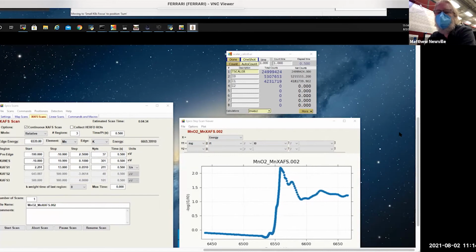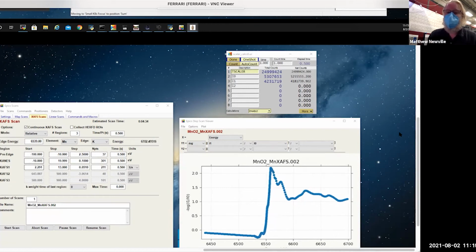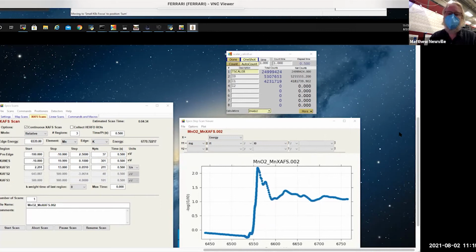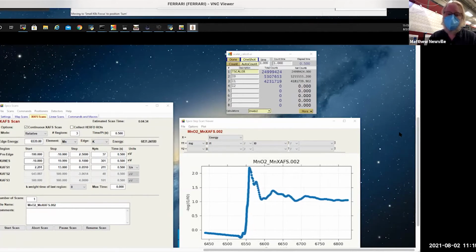Jay asked, can you give us a tip to make a good sample? Right, so for XAFS measurements, in general, you measure the sample you have. It depends on the systems you're looking at. For transmission XAFS of concentrated samples, like these simple oxide powders, these are the hardest to make. For manganese oxide, you want a sample that's one absorption length thick or so. That's 10 microns. You want a sample that's uniform across the beam, with a thickness of about 10 microns.